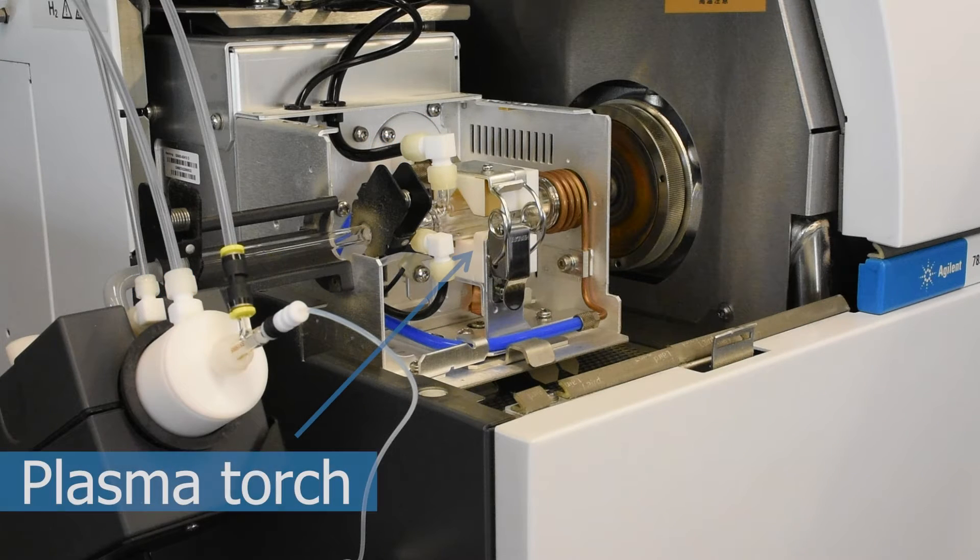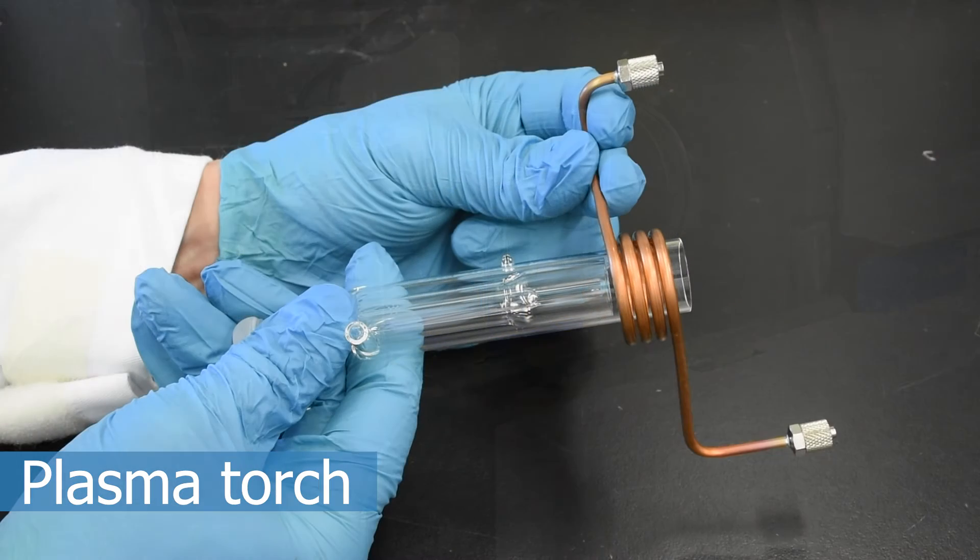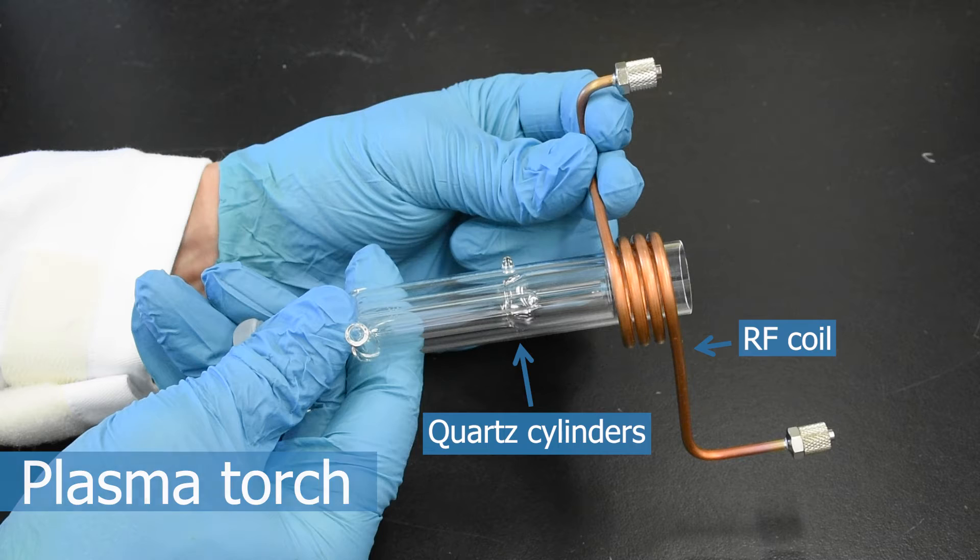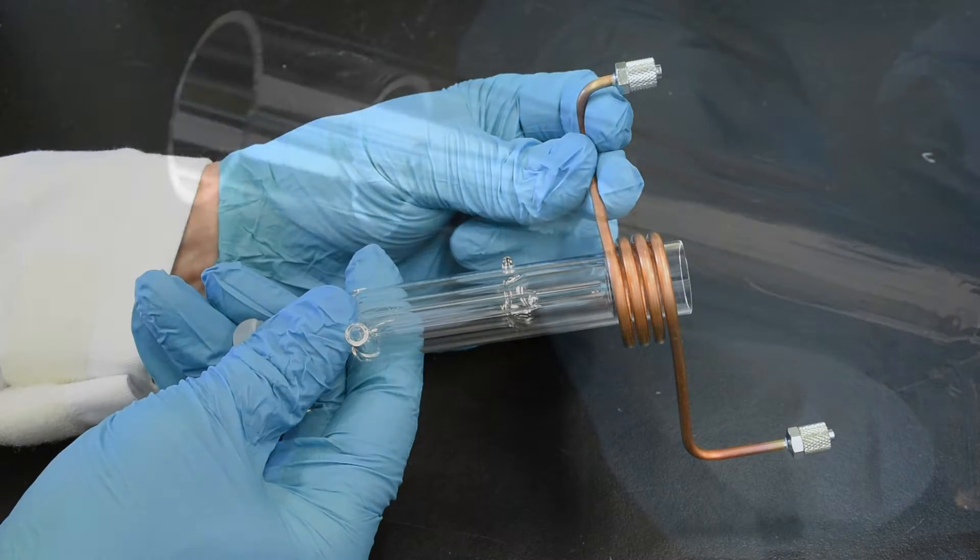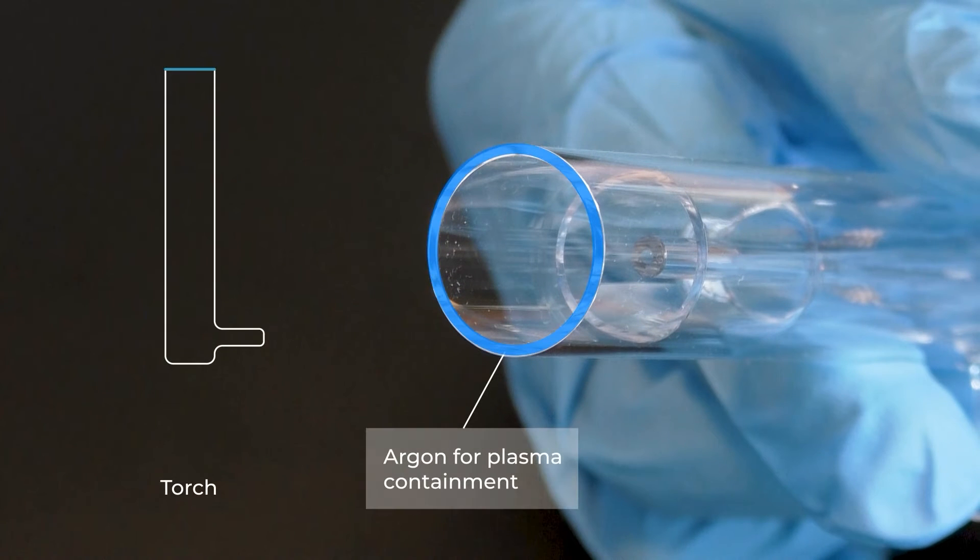The torch is composed of three concentric quartz cylinders and has a radiofrequency, or RF, coil around it. The RF coil provides the power for the plasma. A steady flow of argon spirals out from the outermost cylinder, keeping the plasma contained and preventing it from melting the torch.